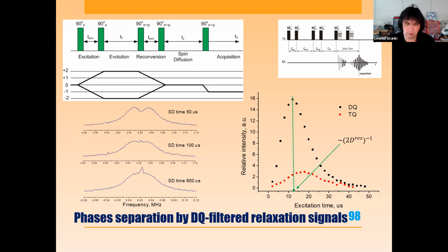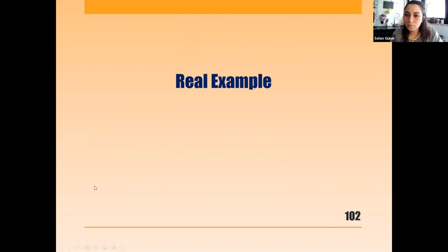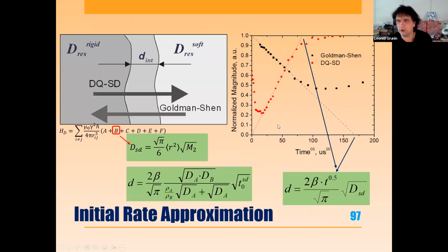Yeah. Then you need to have a kind of imagination of what the structure is, just to understand where this magnetization can flow. If you don't have any rigid component, it will not flow to the rigid component. If you have it, it will flow there. I didn't say anything about detection, because during the spin diffusion experiment we can detect the short, middle or long component and see how it changes with time. Our idea is to see how the magnetization is leaving some domains and coming to other domains. If you excite only amorphous parts, then magnetization will leak to the crystalline part. Then the question is what regions of the FID to select to detect, what to subtract, and how to normalize to leave only the contribution of spin diffusion.